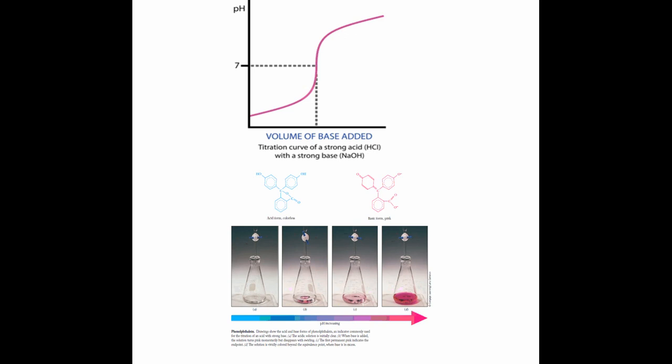So a couple of pictures here. The graph, first of all, is showing our acid solution and the pH of the acid solution. Initially, our sample from the environment is down below 7, so it is an acidic pH that we have here.